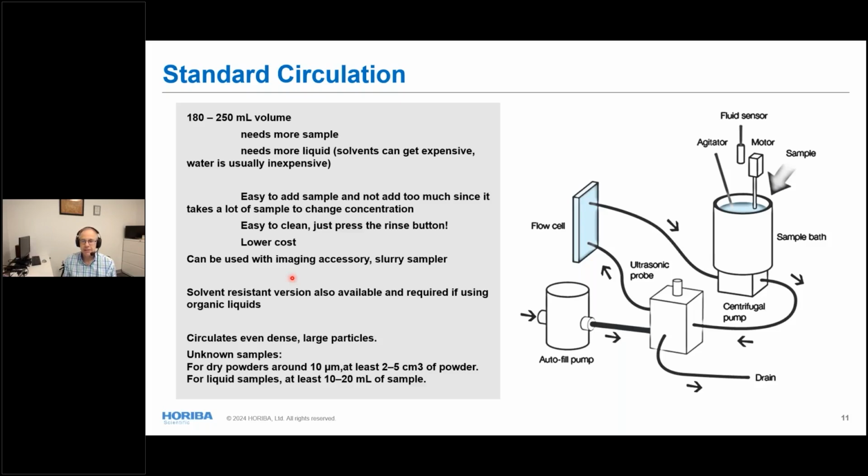Again, that's not a single measurement. We've done measurements, depending on the sample, with much, much smaller masses or volumes of liquid. This is something where we feel very comfortable, and it gives us enough room to go on and do some light method development.